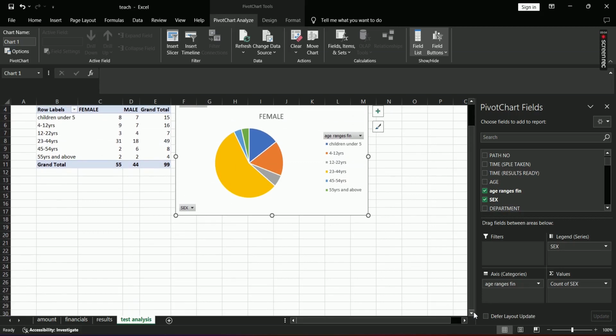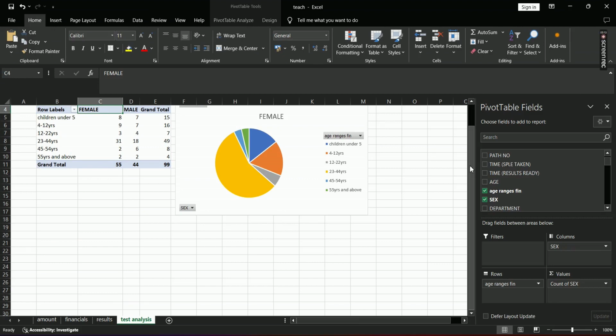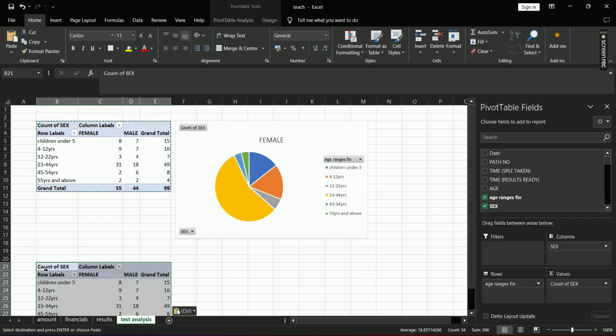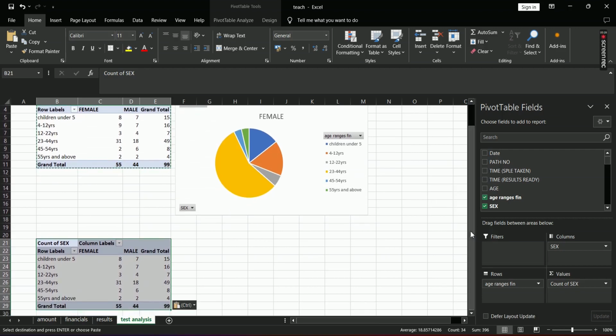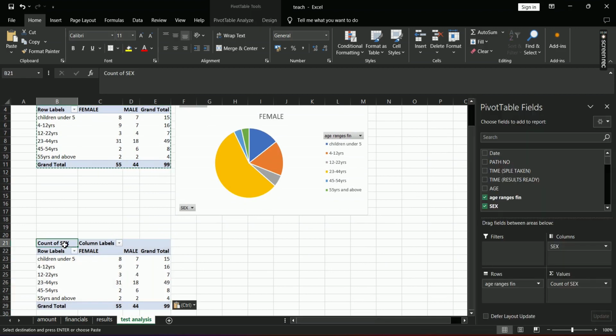So for those of us who do monthly reports for malaria, for instance, let's go through that. I just want to select this pivot table since it has all the same information I'll be using. If not, and you'll be using another table, then you have to go through the first process and select the table that you are using.